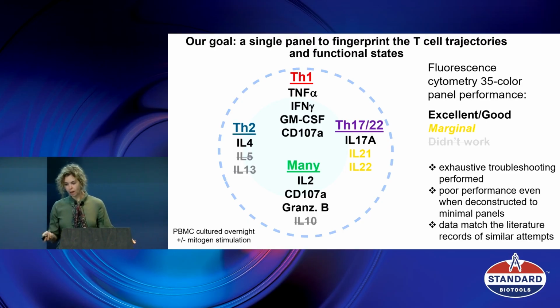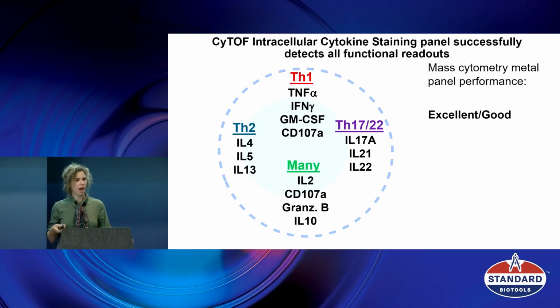So this is when we were like, okay, people from the mass cytometry field found this moment to lure us into mass cytometry world. So we built a panel with mass cytometry with the same set of markers, I mean, more or less, maybe a few were different. And everything got detected beautifully. And I was shocked because, okay, these experiments were not aligned 100%, but still we used the same clones. I couldn't understand why this does not work as expected.